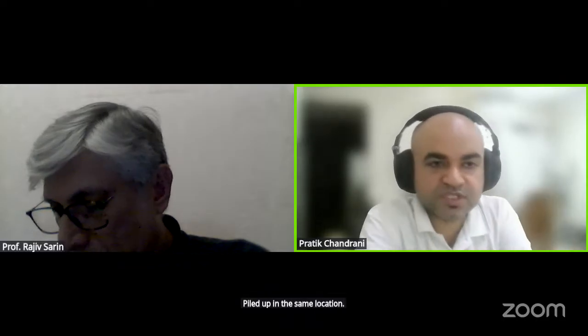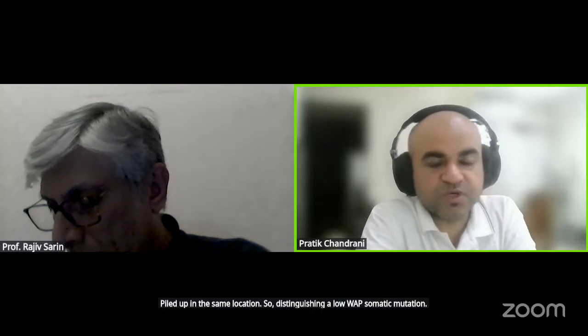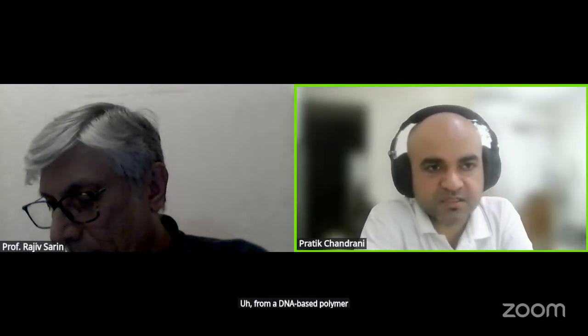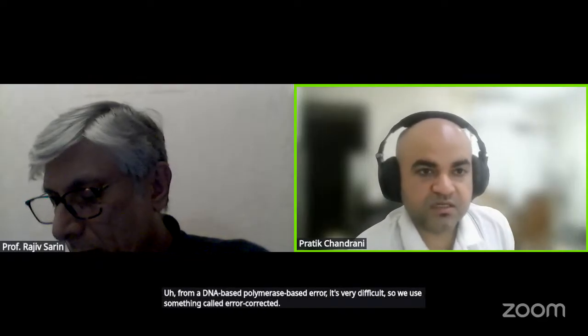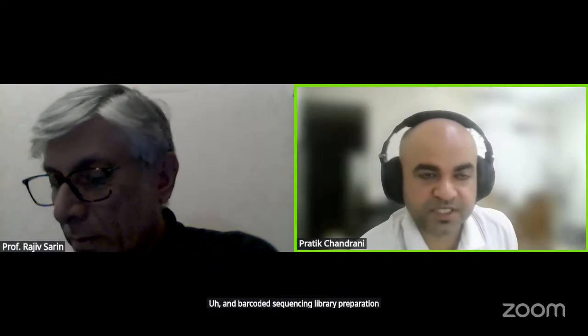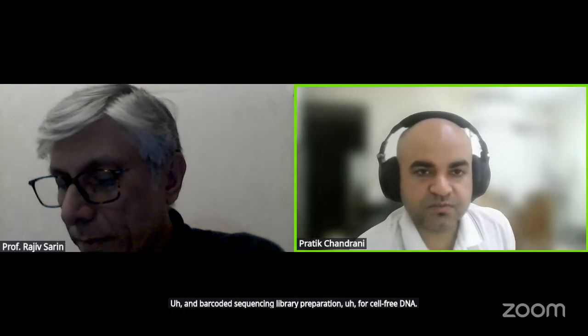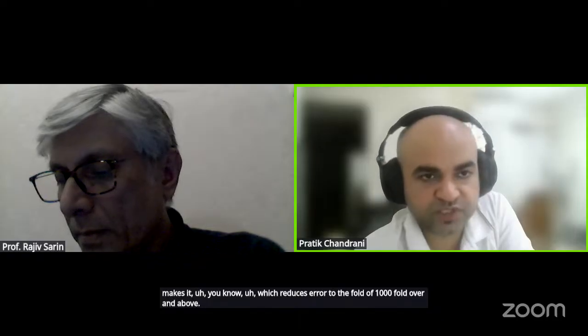So distinguishing a low VAF somatic mutation from a DNA polymerase-based error is very difficult. So we use something called error-corrected and barcoded sequencing library preparation for cell-free DNA, which reduces error by up to 1,000-fold over and above what the Phred score can achieve.